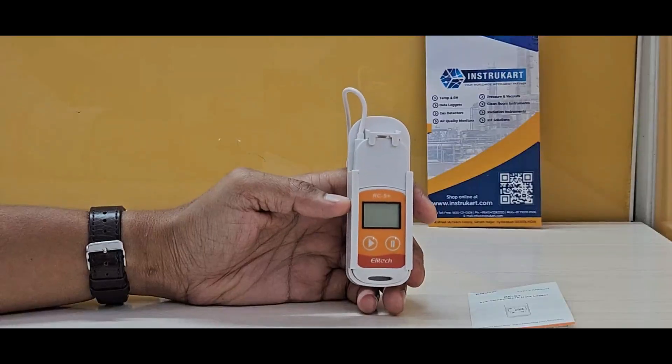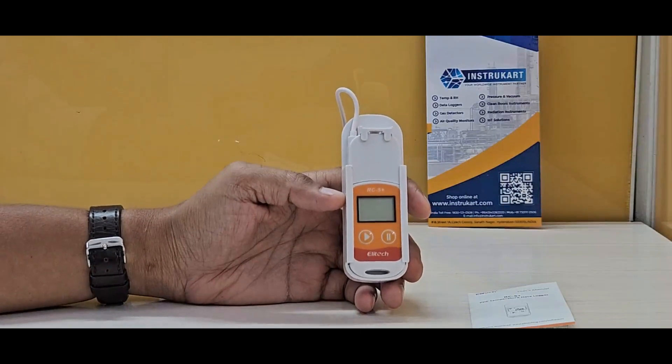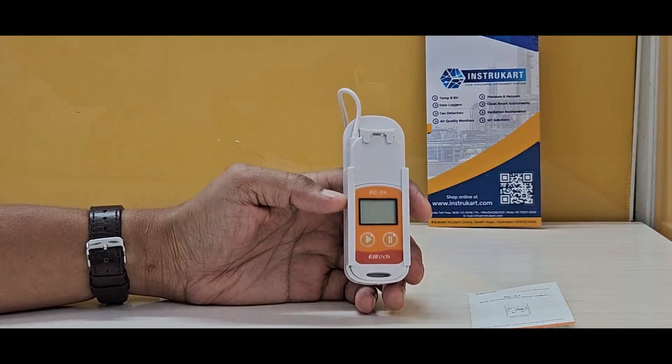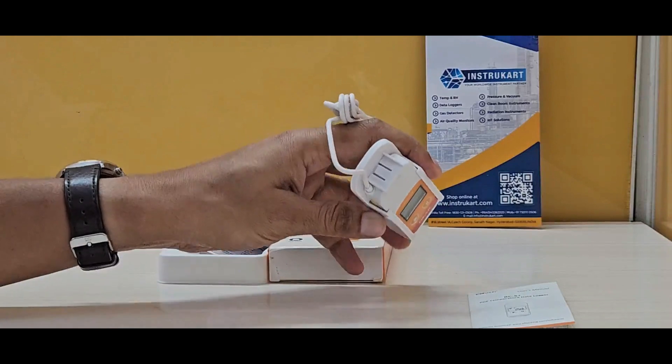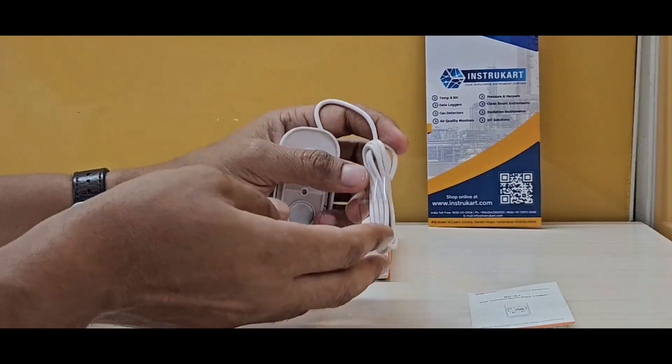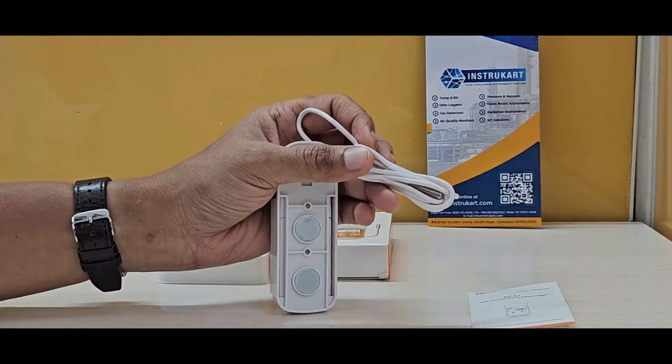Hello and welcome to InstruCart, your worldwide instrument partner. We have got a temperature data logger from Elitech, and this is the RC5+. This temperature data logger has a unique capability of having temperature recorded with an external probe or external sensor.